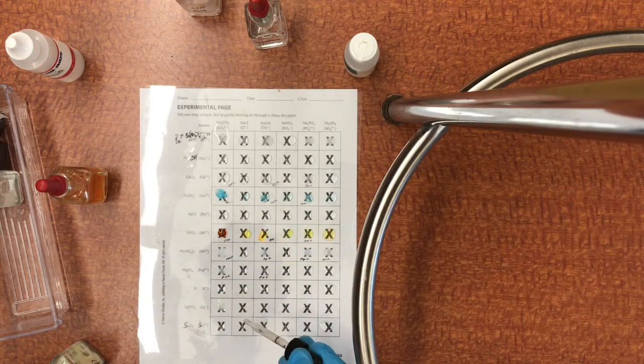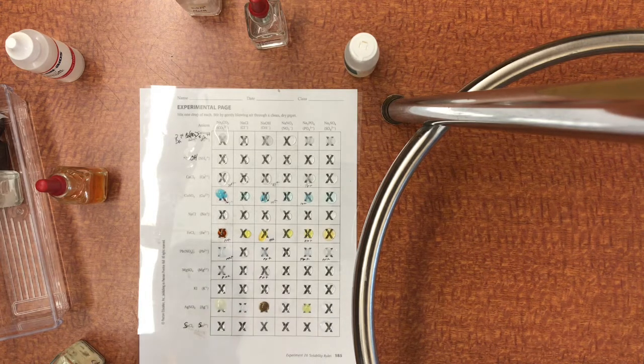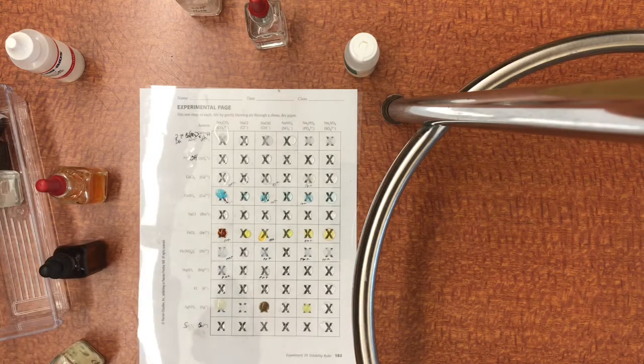And so there's a very strong reaction with the carbonate. Strong reaction with the chloride. It's the only one that has a strong reaction with the chloride. Strong reaction with the hydroxide. No reaction with nitrate. Strong reaction with the phosphate. And looks like no reaction with sulfate. So this is the silver's reaction. We can even see there's some interesting colors coming.